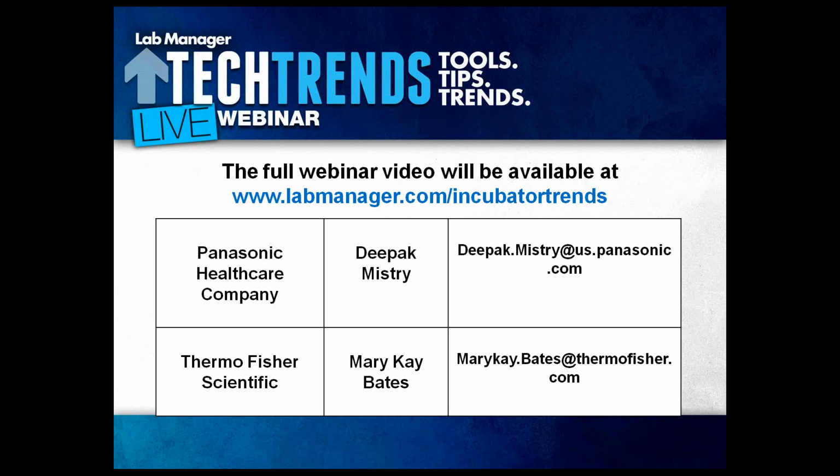So the next question is about the sensors. Which one is better? Would you recommend a TC versus an IR?